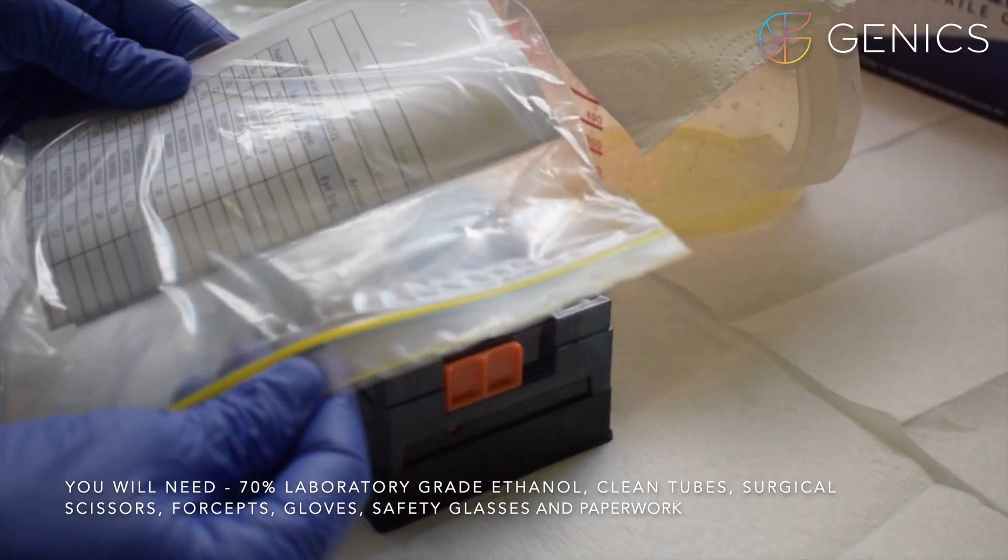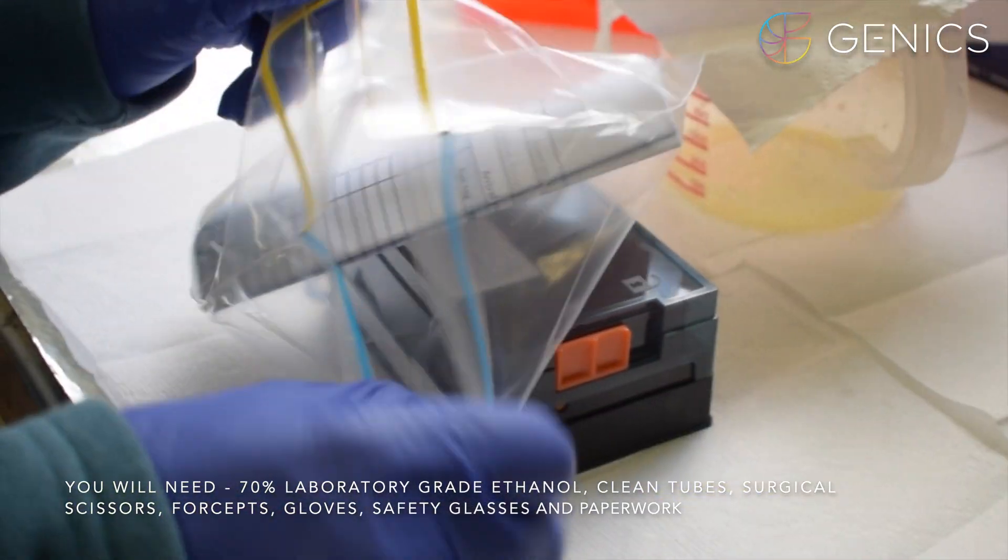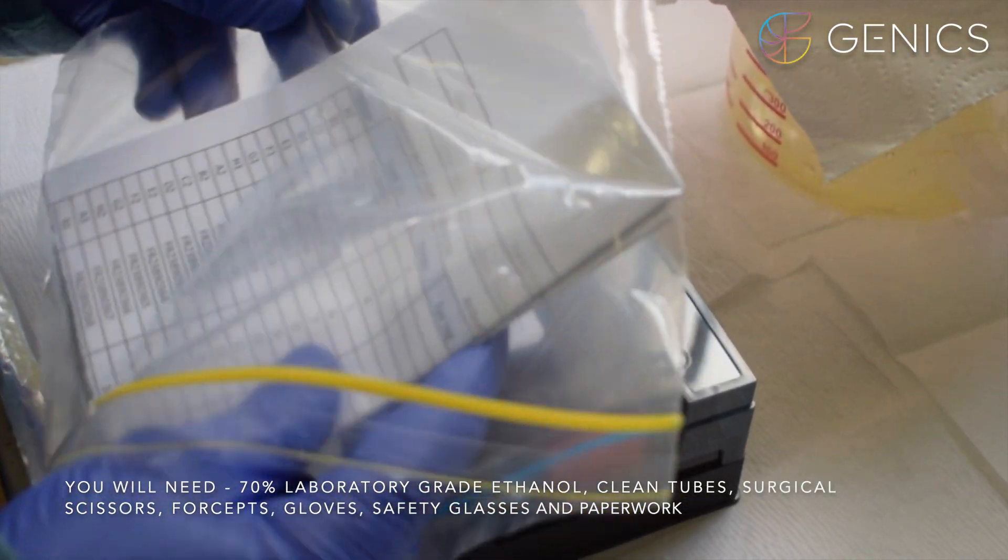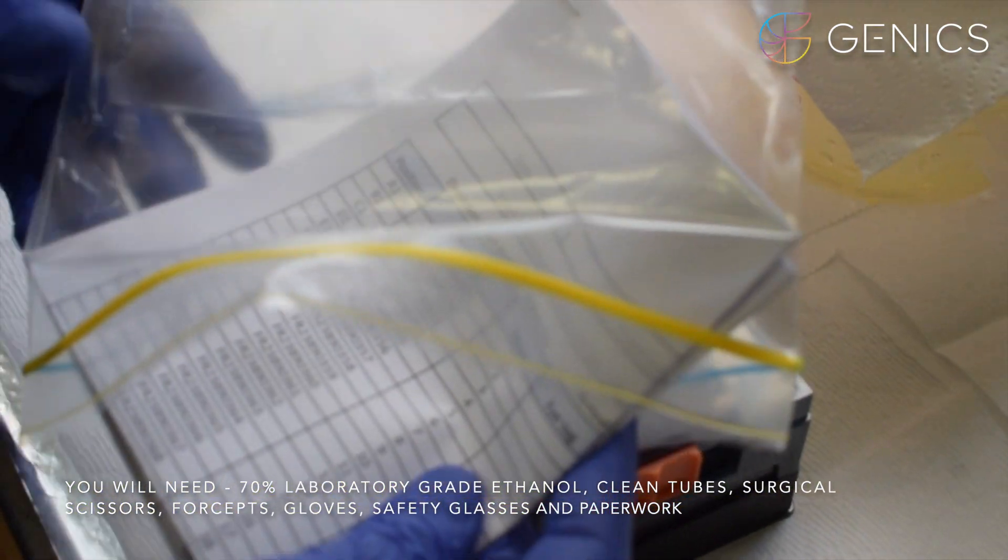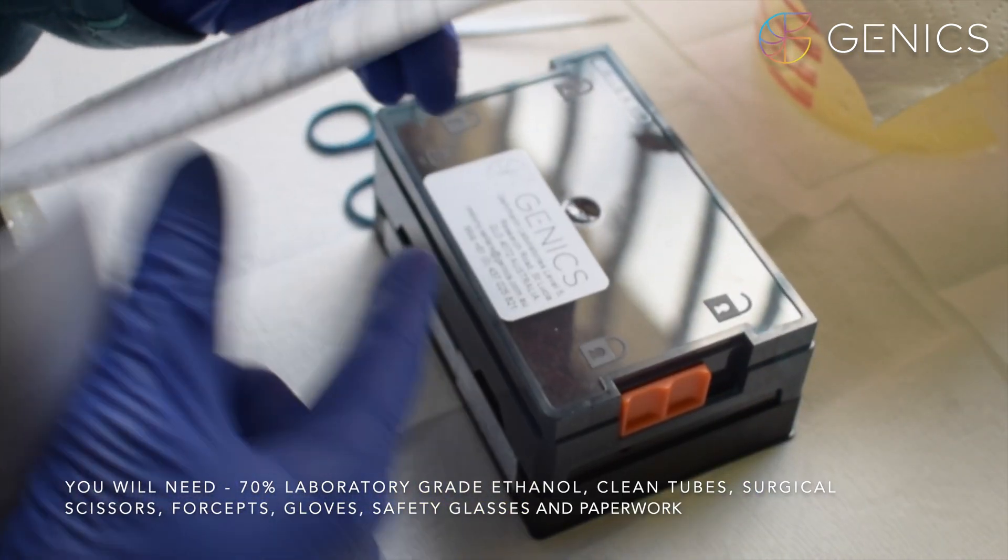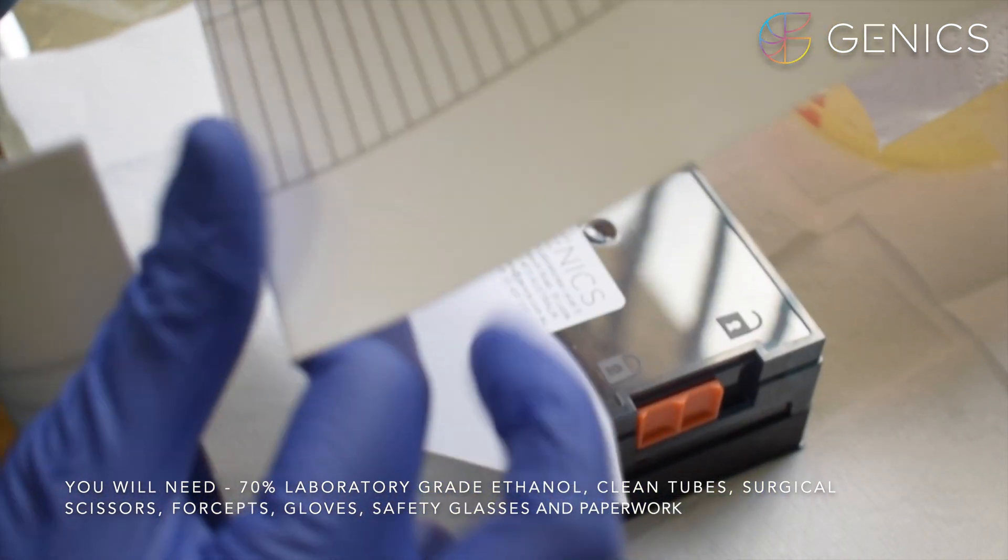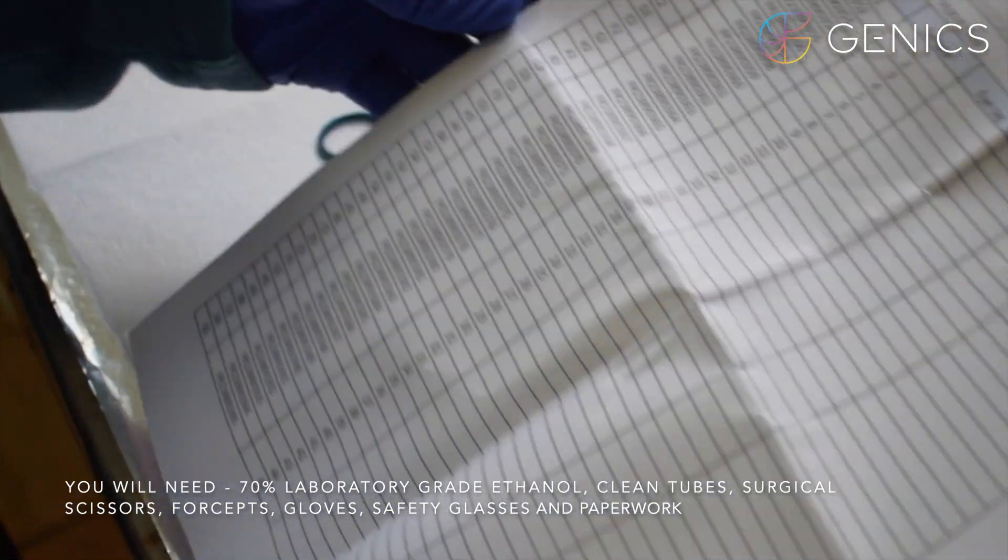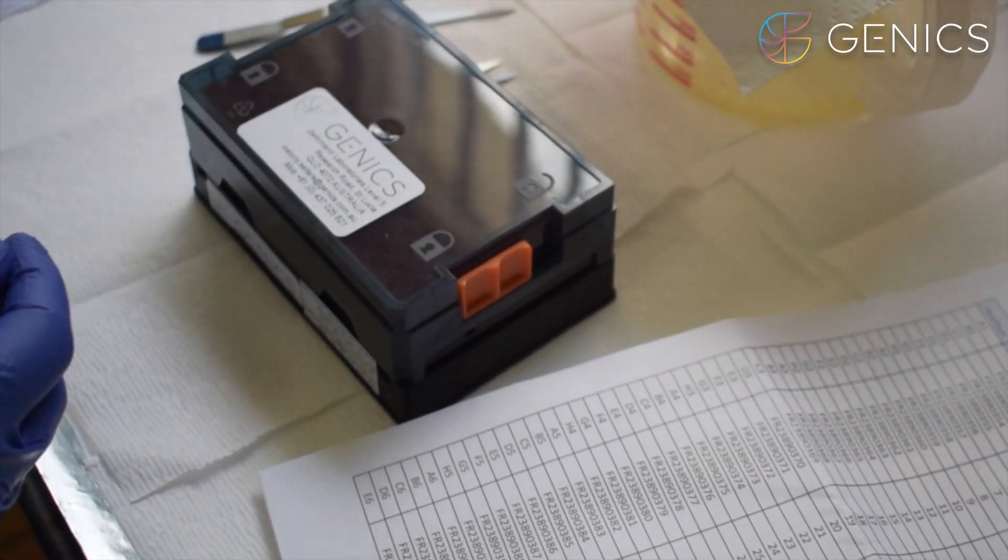Here we have the Genix tube rack which has a paper data sheet and we also send you the electronic file which matches. The first thing to check is that your skirt barcode on your tube rack matches the barcode on your data sheet.